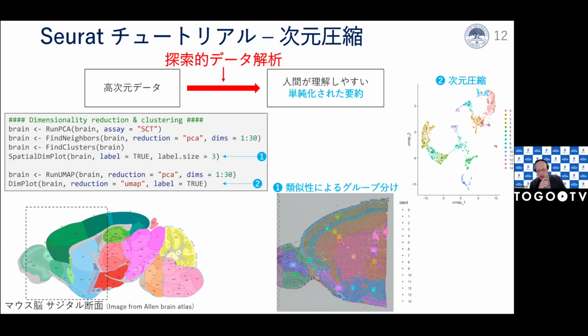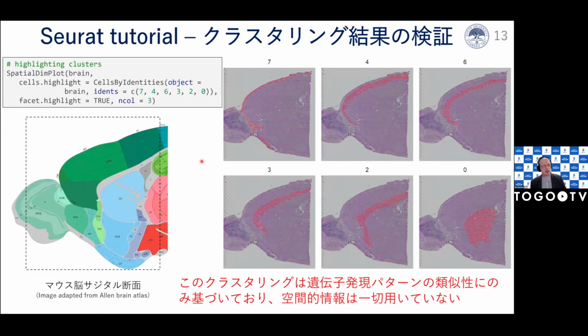And actually here I can see, so here I have cluster 2, 3, 6, 4, and 7. Here too, I can see 2, 3, 6, 4, and 7. They are somewhat connected in this way, showing how they are comparatively similar to each other, right? So using those kind of steps, I can get some idea of what is inside this data. I will skip this slide in the interest of time.